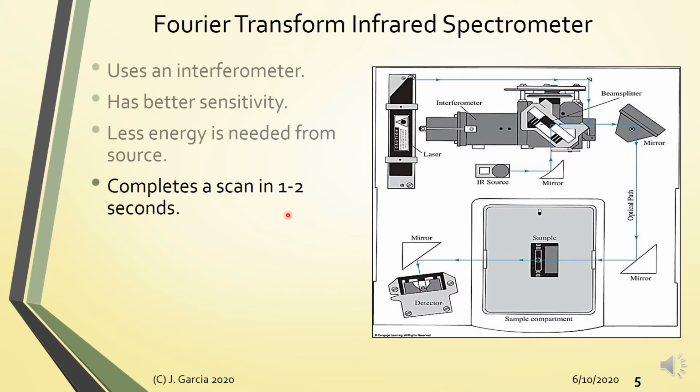All of the scans are then averaged. When you average these repeated scans, you are increasing the signal to noise ratio and hence the sensitivity of the analysis. The number of scans you do depends on the level of signal to noise ratio that you want to get.